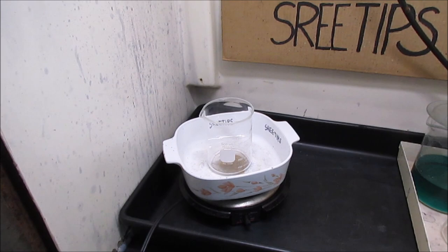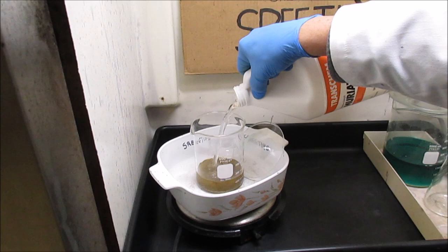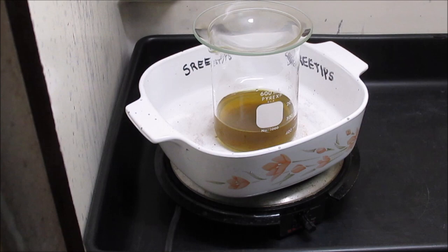Now I'm going to put some hydrochloric acid on it. I'm going to fill it up to about the 150 ml level there. Now I'll put some heat on it. Throw it up to medium heat here on my burner. Time right now is 3 p.m. We'll just let this sit on here and cook for a while and see what happens.